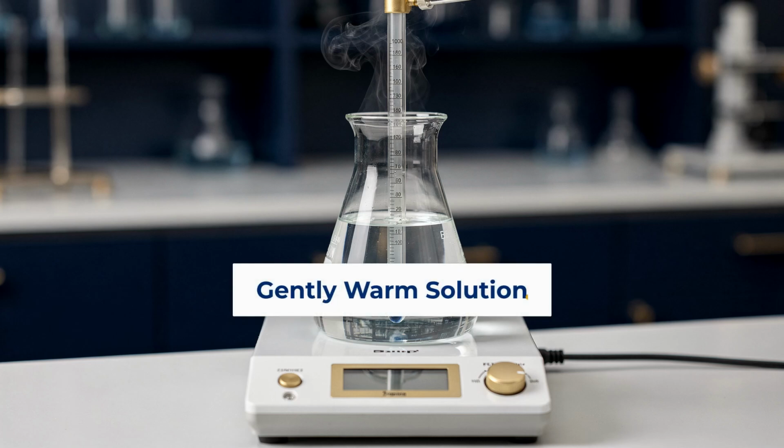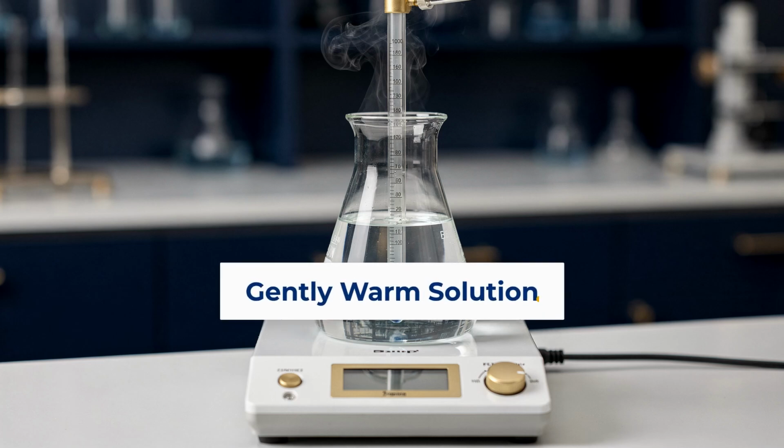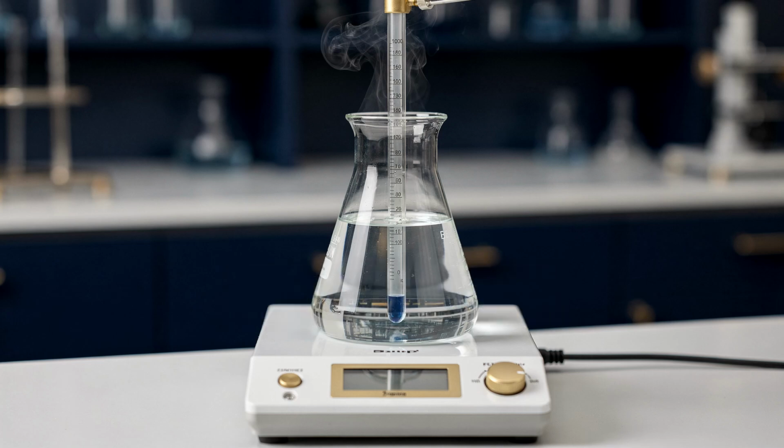At room temperature, the reaction between permanganate and oxalate is relatively slow. We must apply heat to initiate the reaction more efficiently. The oxalate solution is gently warmed before the titration begins.